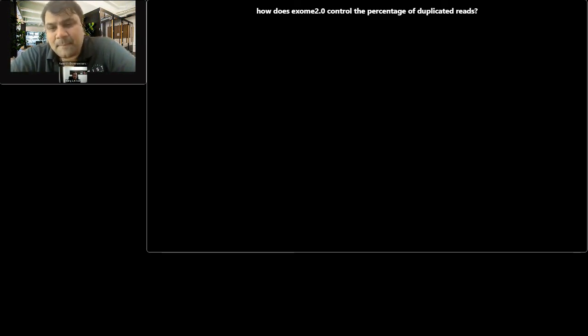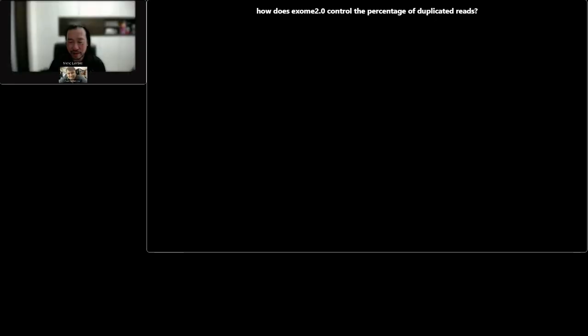Good. Next question. If 2.0 has UTR coverage, etc., didn't you find any on-target difference between standard and rapid hybridization? I presume it's standard and fast hyb. Yes.